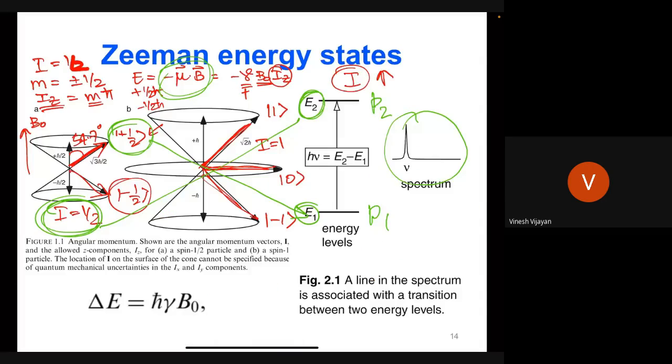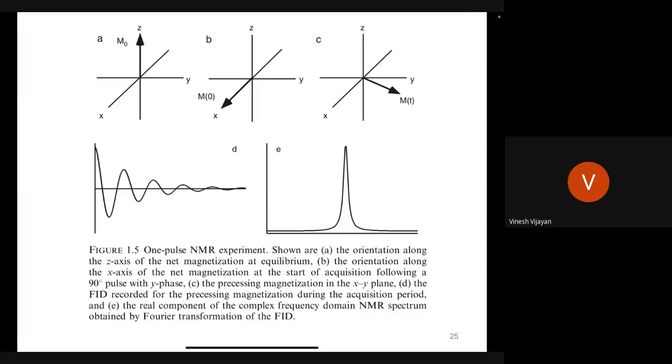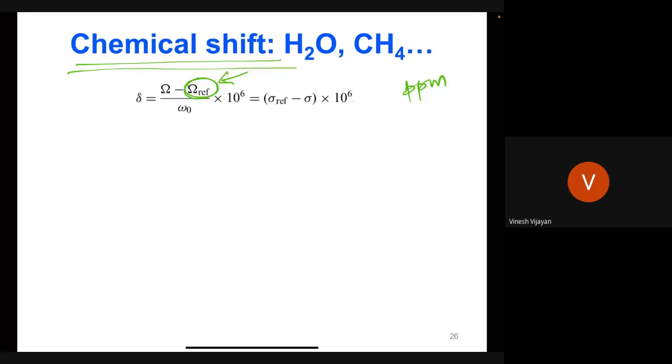And any energy that we end up depicting in NMR is represented from the reference frequency. And this is the frequency of interest that you're trying to measure. So basically, you take the difference between these two frequencies and divide by the spectrometer frequency. Let's say we are using a 700 megahertz, and these two are a few kilohertz away from each other.